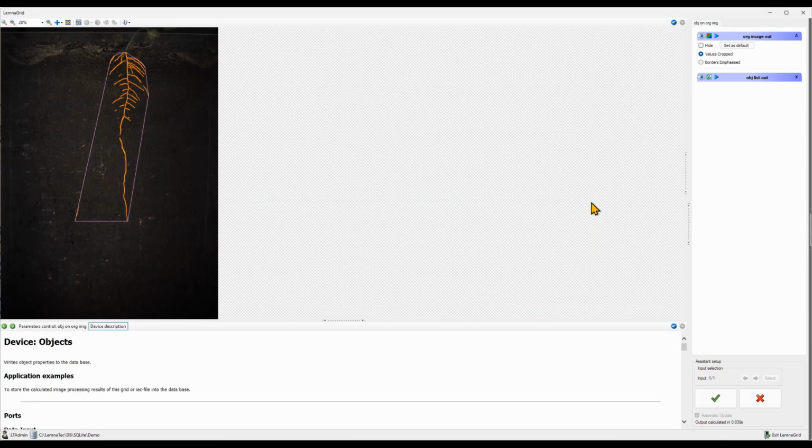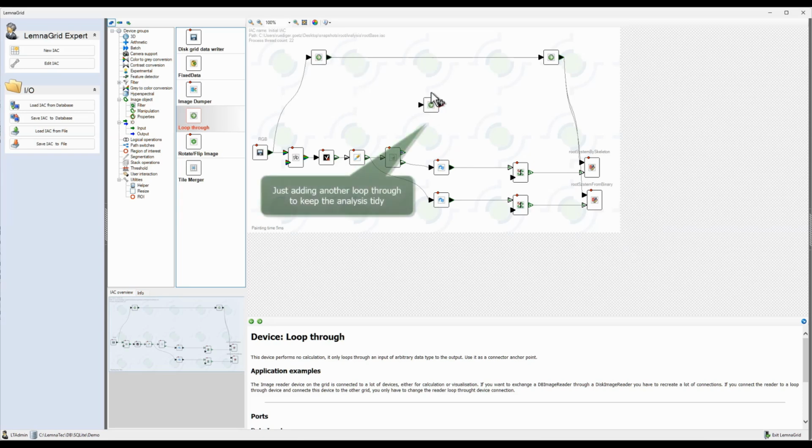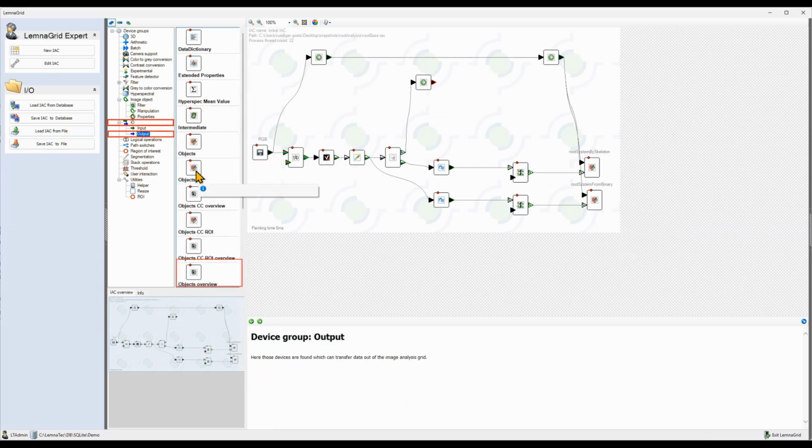Most of the morphological parameters shall be similar or identical within the margin of error. However, the size or area now represents the visible root area rather than being a proxy for the length. On the other hand, we can use a skeleton output to create results. The simplest way is to use a skeleton list overview writer.